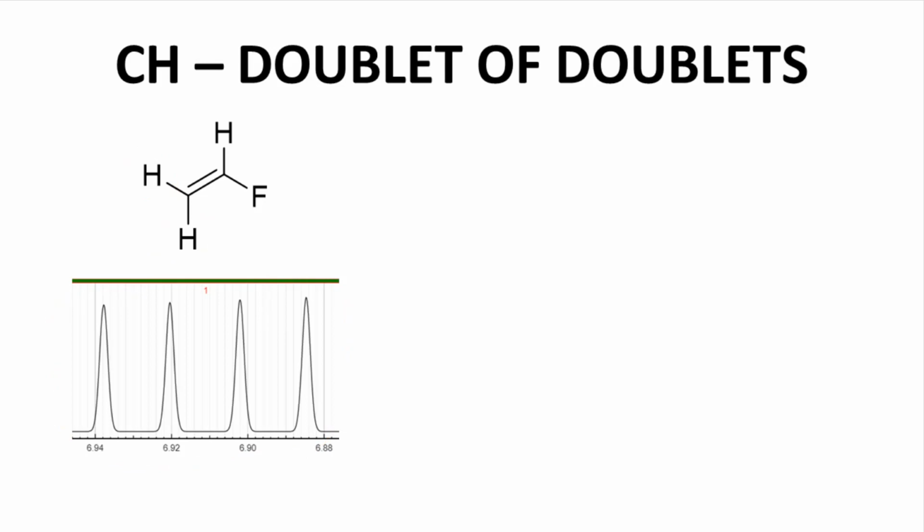What is it? Okay, our signal from this hydrogen will be split by the trans neighbor HT with a larger J value, JT, into a doublet. Each peak in the doublet is in turn split by the cis neighbor, HC, with a smaller J value, JC.